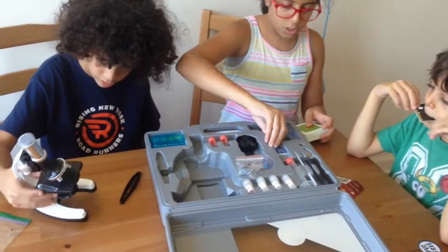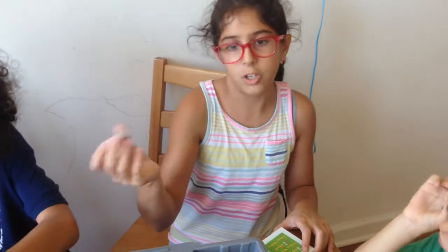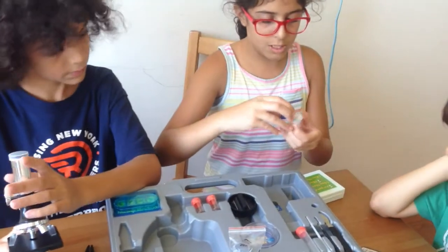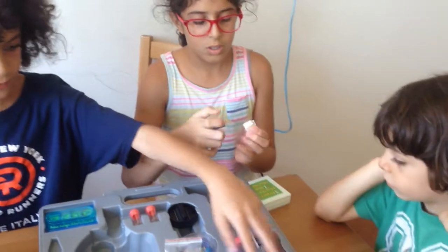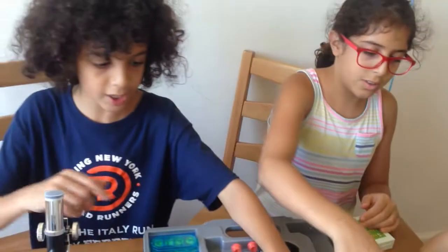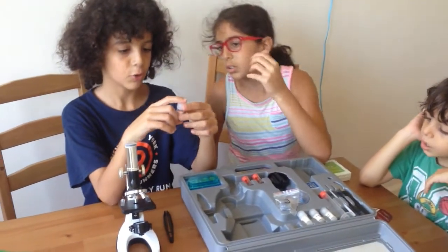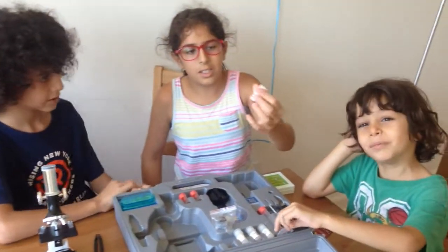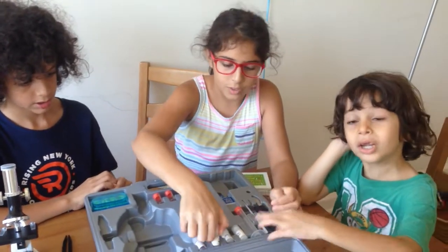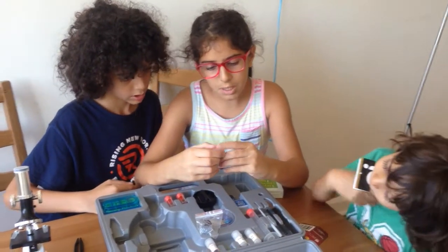It also comes with cover glasses, which are part of making your own slide. Here are some labels. And here's a knife. Here are some things that they put in it, like eosin dye. They put some dye, and also gum media.